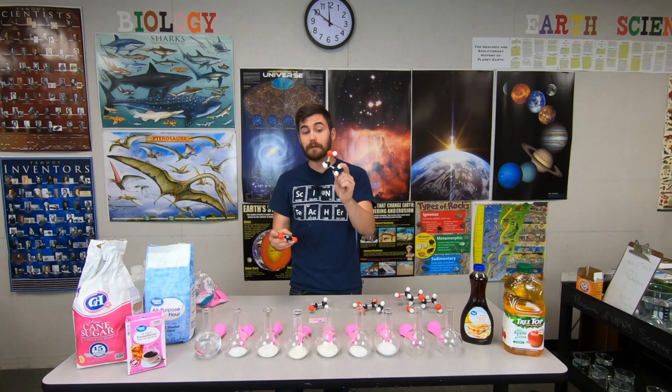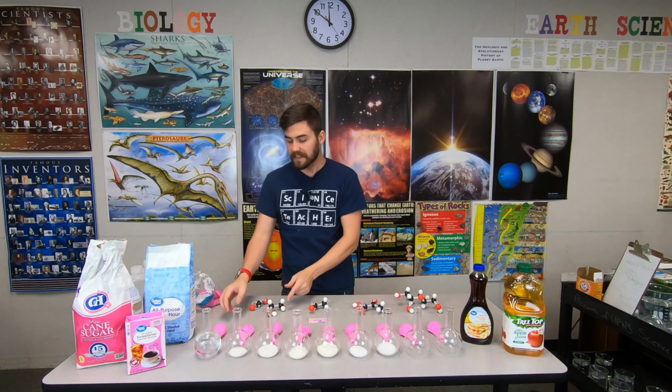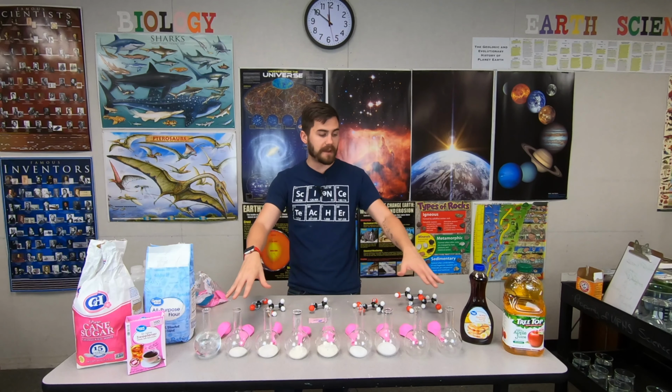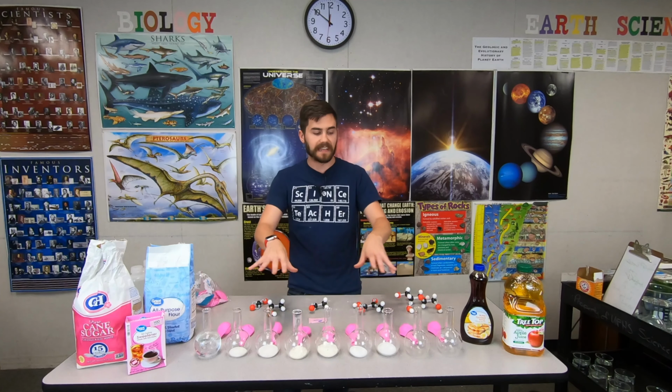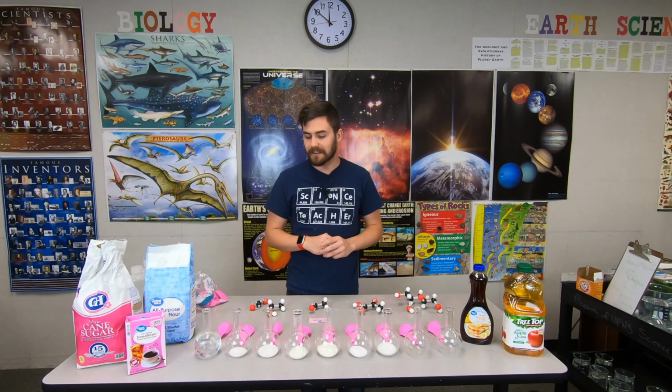In this lab, we will be making these two compounds, and we're going to use balloons to try to capture the carbon dioxide gas and compare a wide range of different food sources to see if the rate of fermentation is affected by them. Here's what we have.